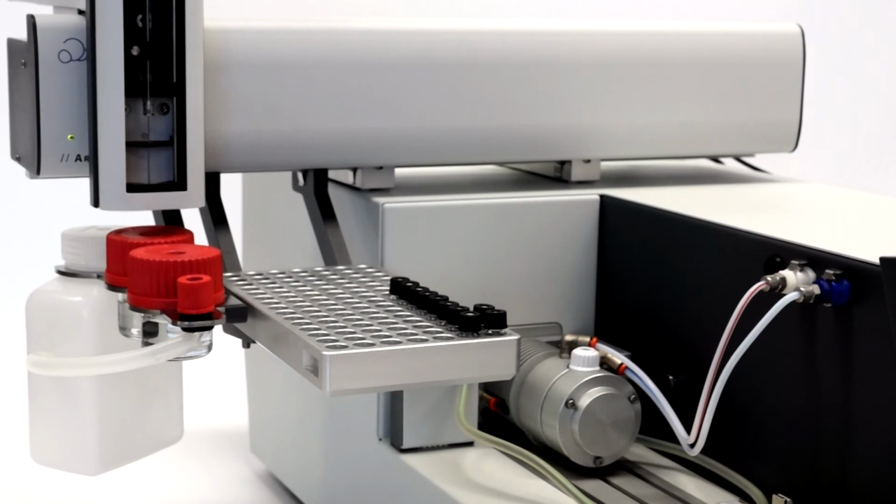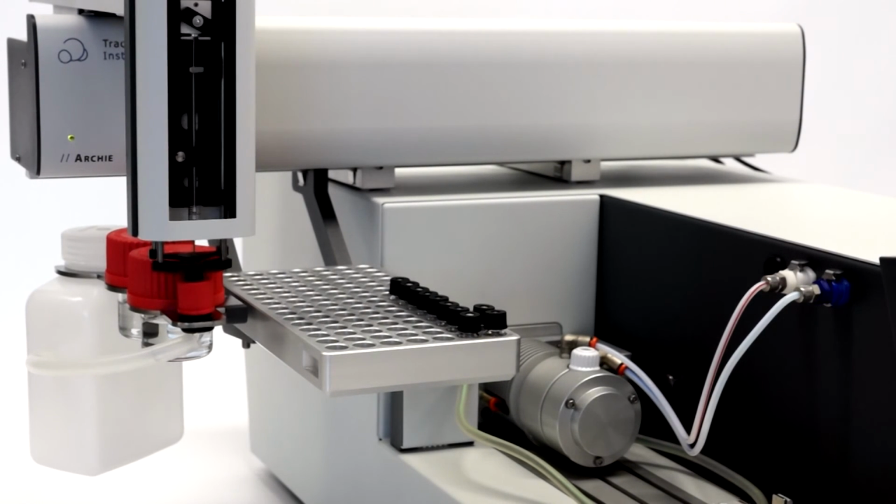Again, the Archie will first clean its syringe before starting injecting into the Xplorer.